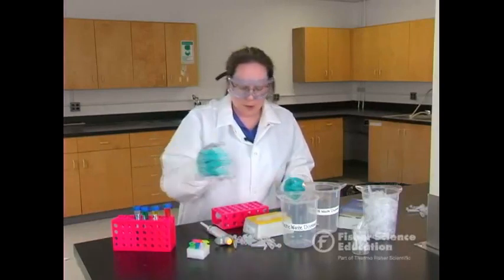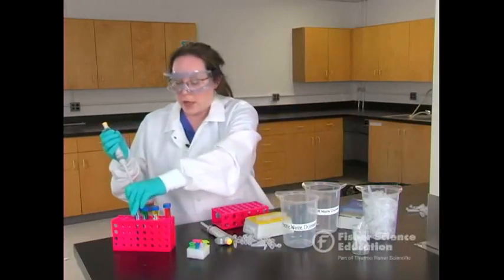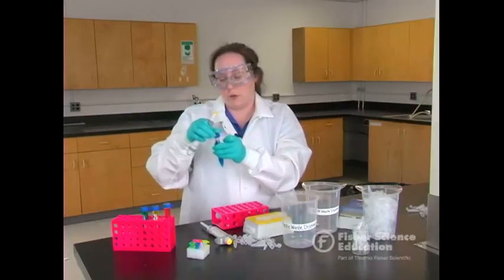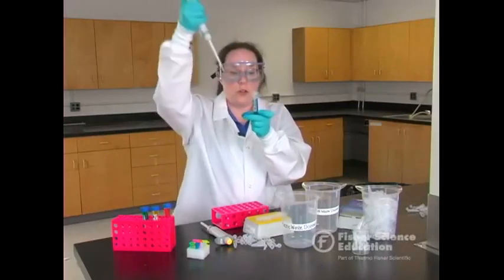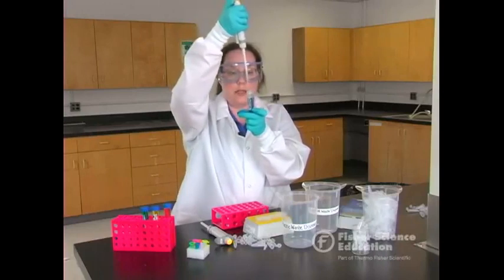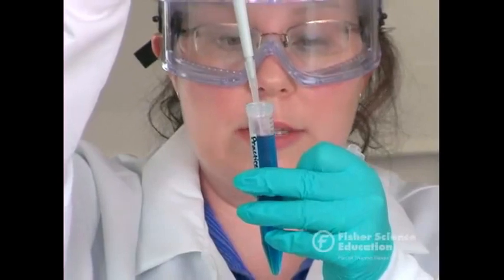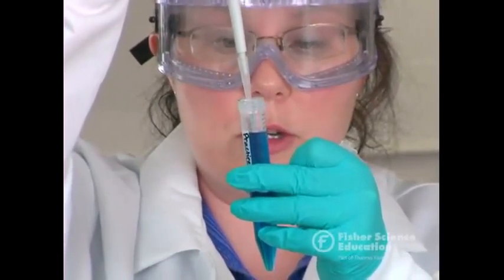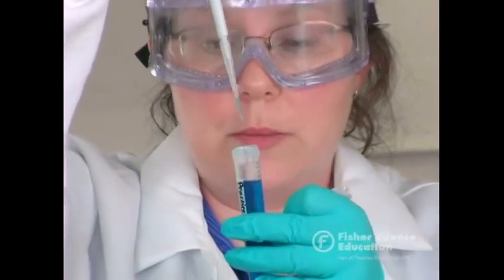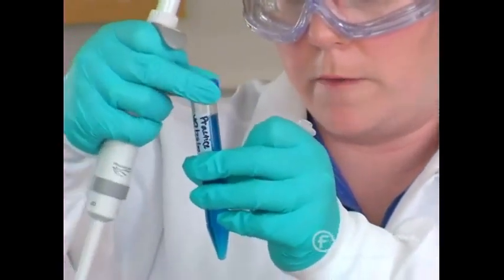Now, one of the common problems I see my students do, because I train them to touch when they eject, they often want to try to touch the walls of the tube as they are getting their samples. And so we have to train our students to make sure that when they're getting sample, they're right in the middle, not touching the walls. Again, because of the cohesive and adhesive properties of water, we want to make sure that they're not doing that. They want to make sure to draw their sample right from the middle with the tip just under the surface of the liquid, keeping that pipette as vertical as possible once there's a sample in it.